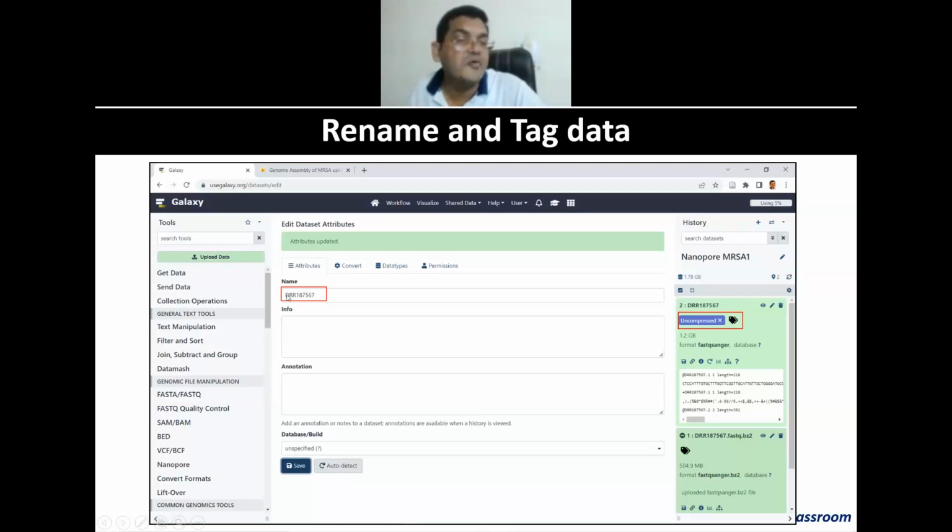So this is just the name of the actual sequence file that you had without any extension. So that becomes a little easy for you to follow up later what is being done. And it is always good to give descriptive names because let's say you go back to the pipeline 1 year later, you may not remember what you have exactly done.